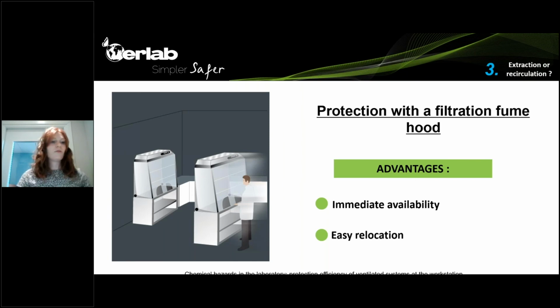So if, for instance, you're building a new laboratory that has no exhaust system available, then the ductless fume hood can immediately be used without having to change the laboratory. And there's easy relocation, as it is not ducted to the exhaust system. So for instance, if there is some work in the laboratory, it's easy to just place the fume hood somewhere else.